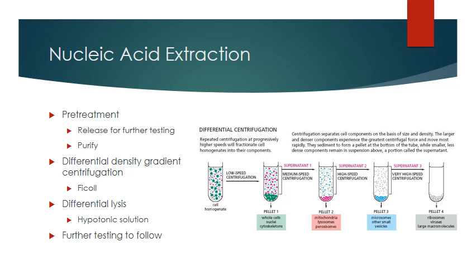So this is going to require some significant pretreatment, you can see here. Initially, it's going to be done by lysing the cell. Okay, we got to get rid of all those membranes, including the cell and the nuclear membrane, and you want to do that under conditions where you won't damage the actual nucleic acid. Then you need to purify the product and determine the concentration and the purity of the product before moving on to the next technique.